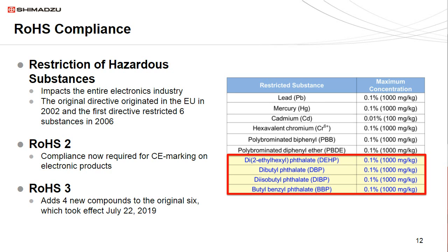In this development, the IEC worked to establish a method where the 4 phthalate esters could be tested and make sure that the limits were below a 1,000 ppm level.